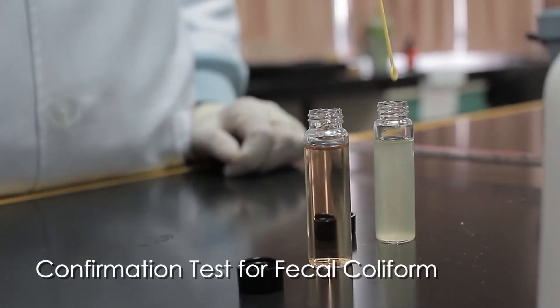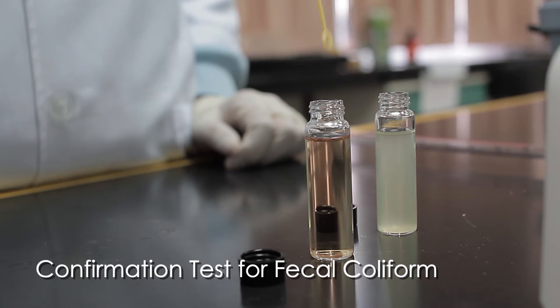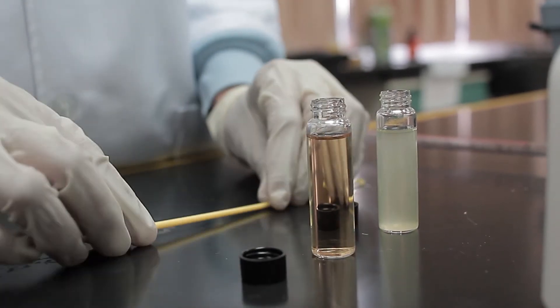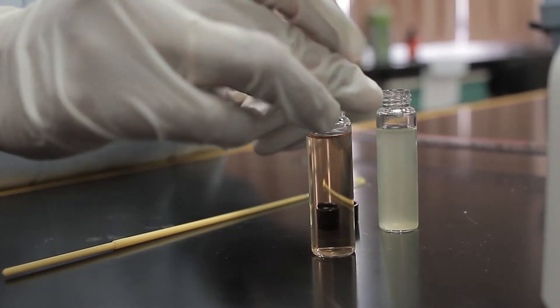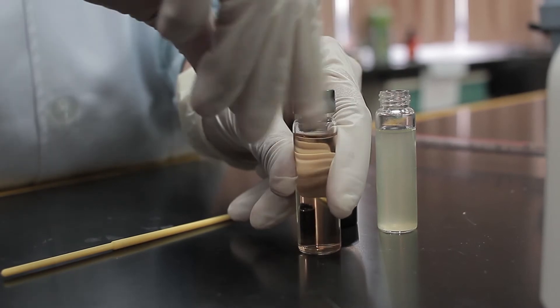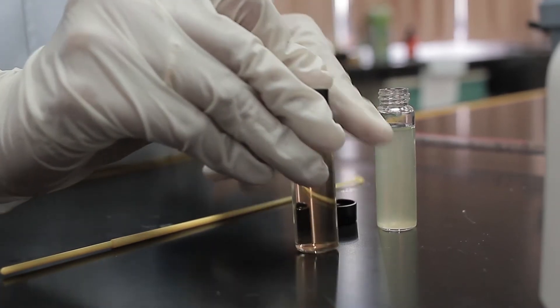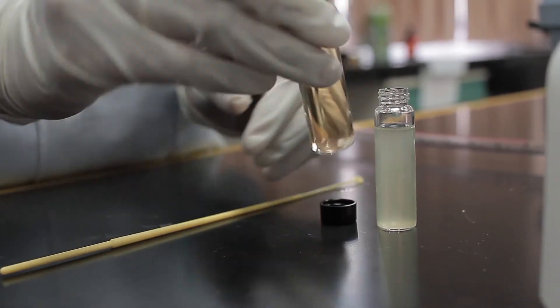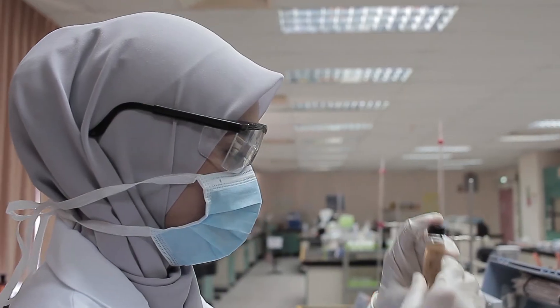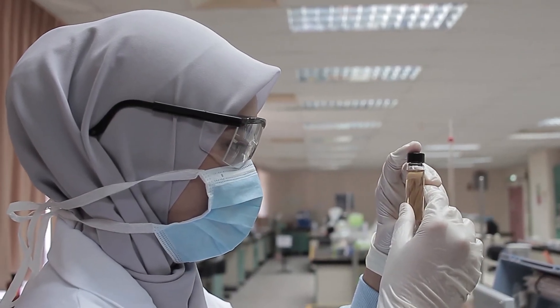From the positive cloudy LT broth tube, inoculate a BGB broth tube by using a sterile disposable inoculation loop. Put the loop into the positive LT broth tube and immediately into a BGB broth tube. Invert the tube to remove air from the inner vial. Examine the tube to ensure there are no bubbles.